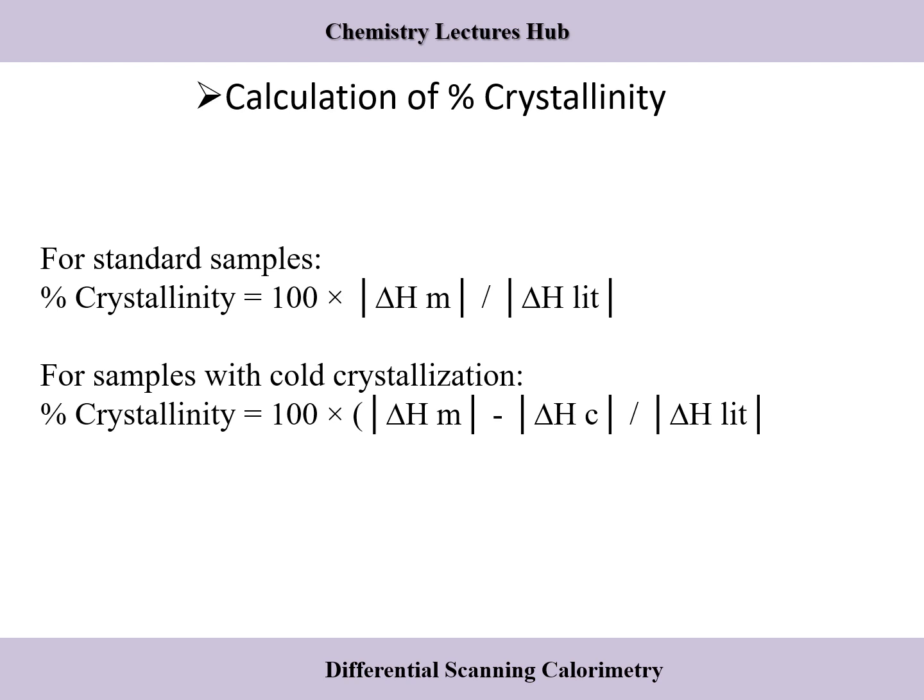Now the question is why the degree of crystallinity is important. A simple answer is that it influences the hardness, density, and transparency of materials. Moreover, it defines stability and drug release properties of the final dosage forms.